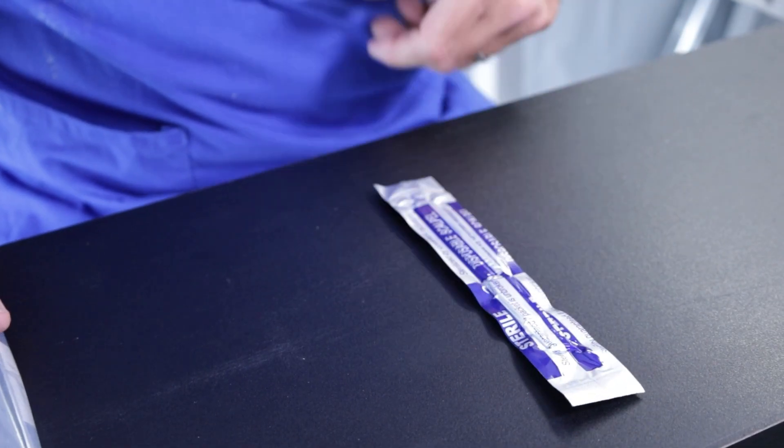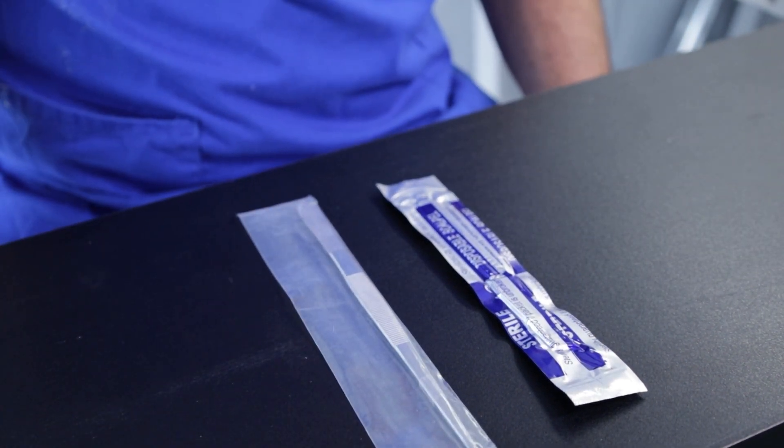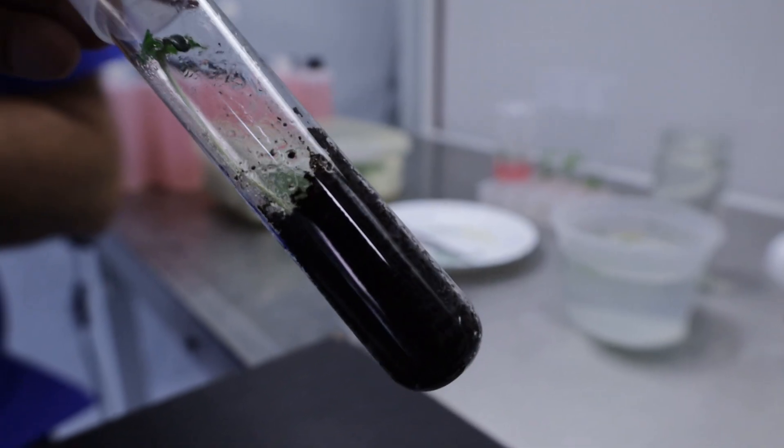Also included, sterile scalpel, the last item in the seed kit, and forceps for picking up your seeds and planting them in the tubes and for extracting your seedling from the tube to go into potting mix.